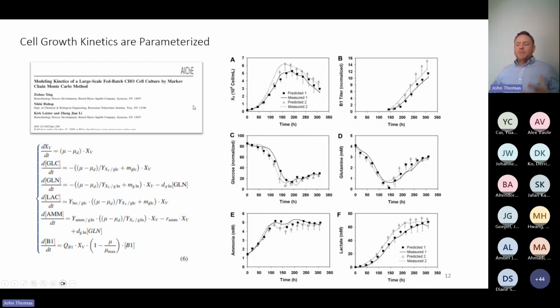That is, we need someone to give us a cell growth model. I'll reemphasize, M-Star is not used to predict a cell growth model. M-Star is used to predict the effects of that cell growth model, in tandem with operating conditions, on fluid flow and on process yield in terms of titer or biomass. And so there are these in the literature, and a lot of good biopharmaceutical companies can develop these. They can look at their cell growth kinetics, understand the sensitivity to feeding, and develop these relationships. But at the end of the day, this is what these look like.